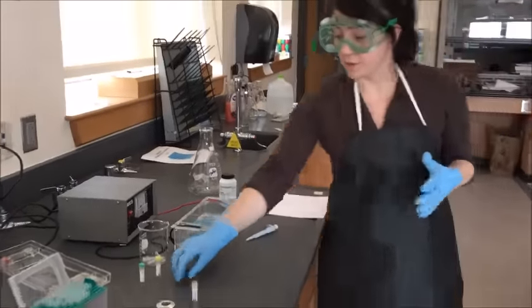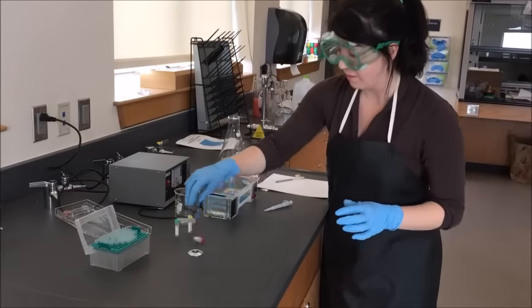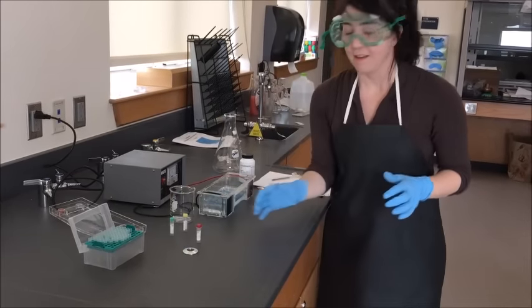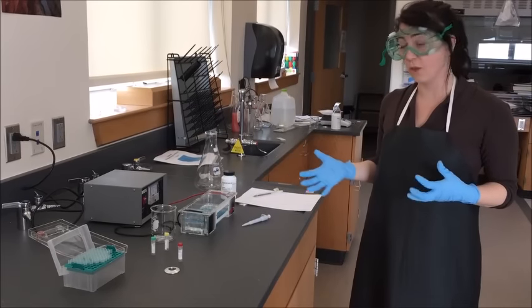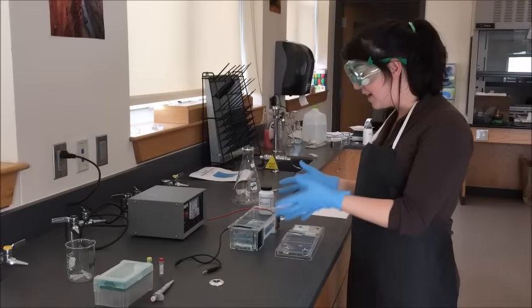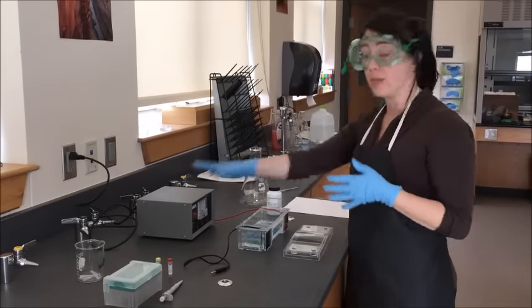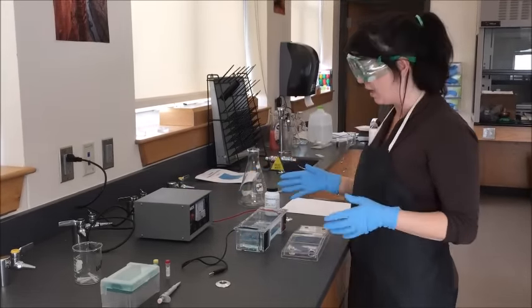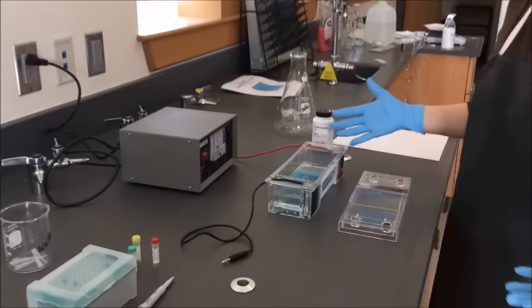Now that I have used all of my materials, I'm going to make sure that I clean up after myself and let the next group go. They are going to use their three empty lanes to load their materials in, and then we will talk about how we are going to run this. Now that we have our lanes all loaded with our samples and each group is done, we are going to plug this into the power box and actually run this gel. DNA is negative, so it is going to run towards the positive end, and that is how we are going to see our banding.